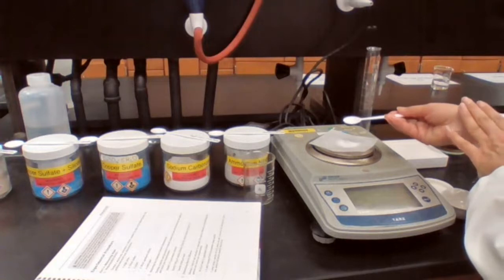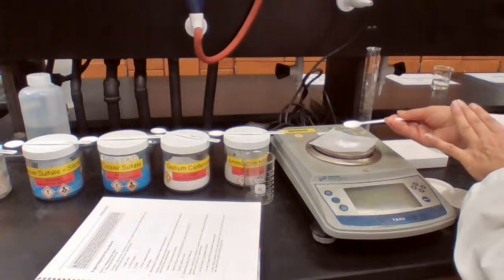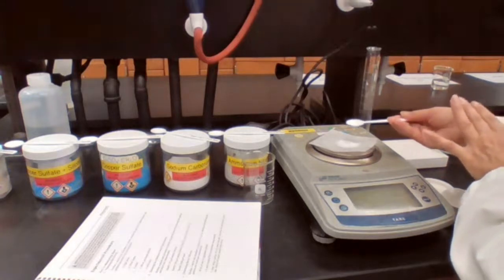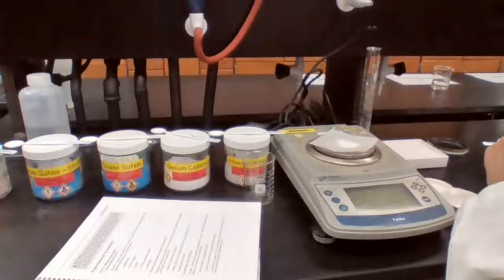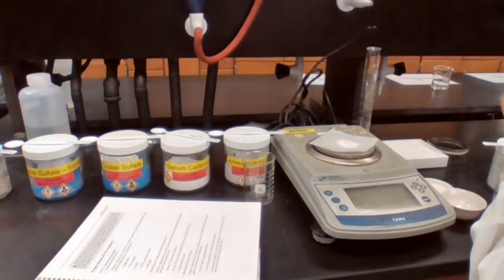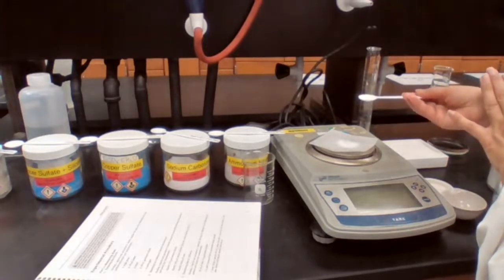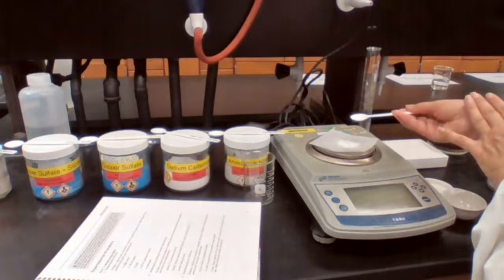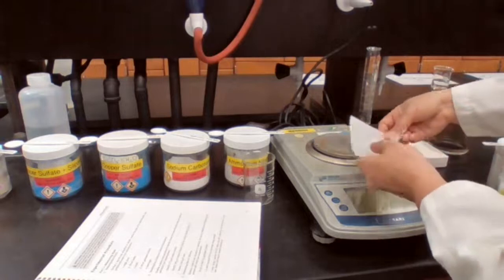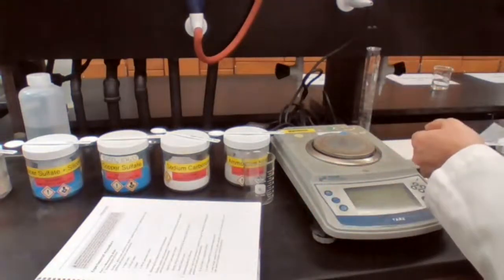Just adding slowly, a few crystals at a time, to make sure that it stops as close as possible to 2.75. Okay. So I have 2.75 grams of sodium chloride, and then I'm going to measure.